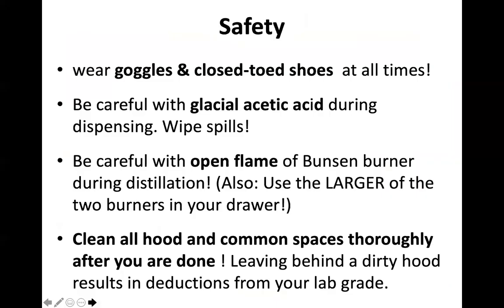All right, just a couple last things about safety. It is of utmost importance, as always, for you to wear your goggles and closed-toed shoes and appropriate clothing at all times during this lab. Please be careful when you're using the glacial acetic acid. While acetic acid is technically just vinegar and we put it in our salad, today we're going to be using super highly concentrated and caustic acetic acid. So this stuff is not to be joked with. Do not try to smell it. It's very acidic, okay?